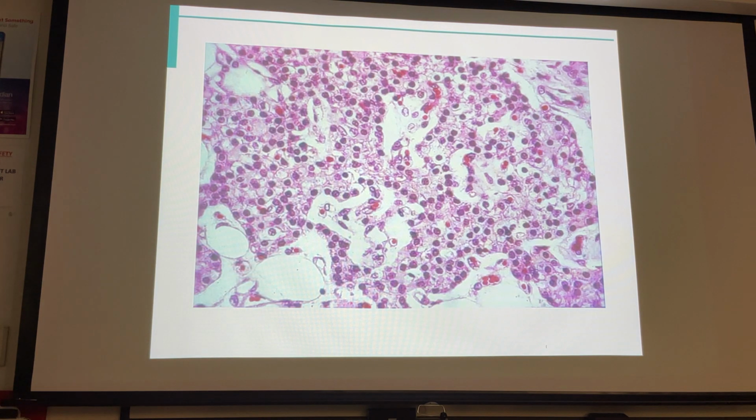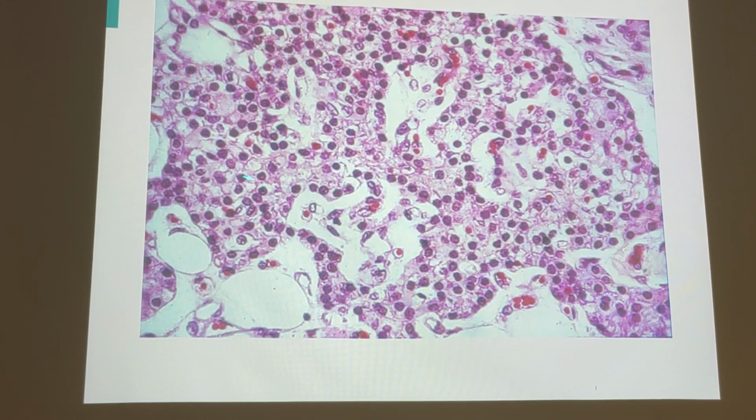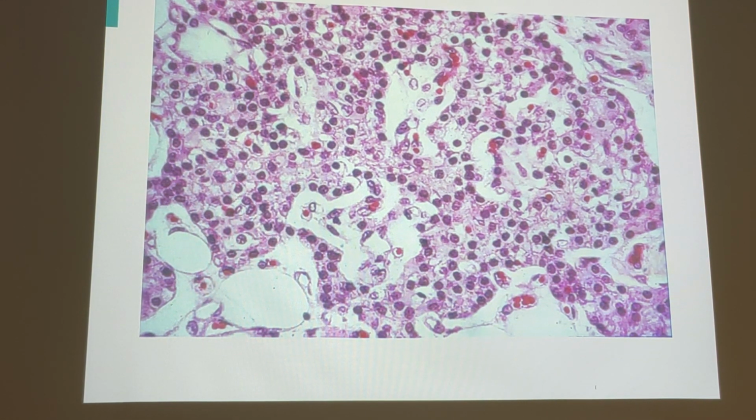Notice if we take a little bit of a closer look. Now, I'm not talking about the adipose. We find adipose everywhere. But notice some of these cells are larger and lighter, and some of these are darker and smaller. Notice this has more of the darker, smaller. But one of the interesting things that happen is these larger cells, the number of them increase as we age.